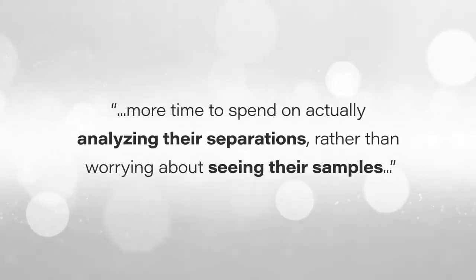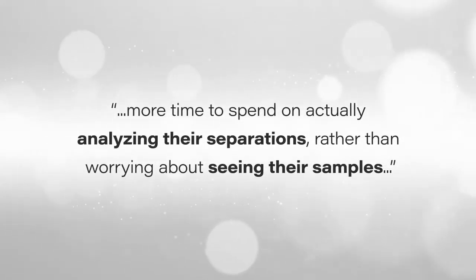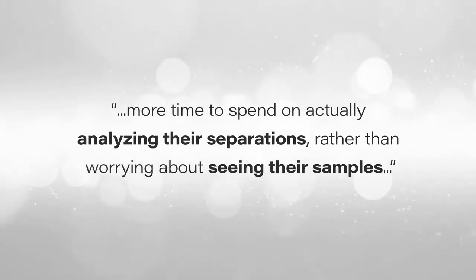In terms of what our customers will see, I think they'll see very much the same as what I see in the lab. So they'll get more time to spend on actually analyzing their separations rather than worrying about seeing their samples at such low concentrations. And hopefully that means that they'll be able to spend time on other research.